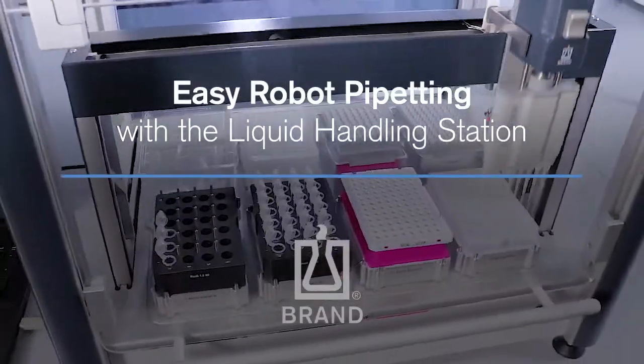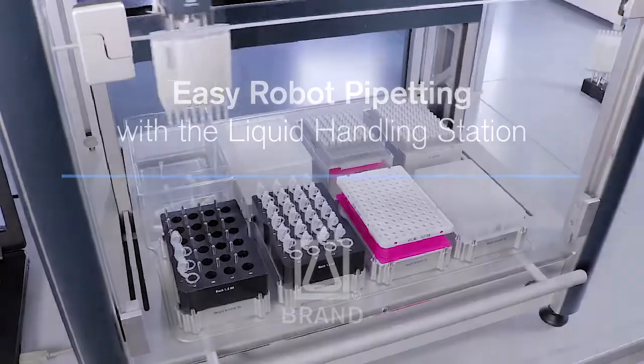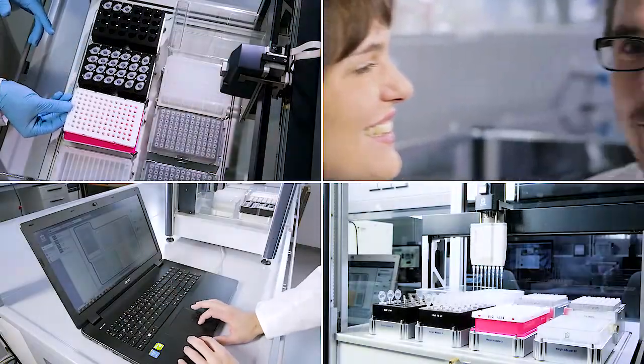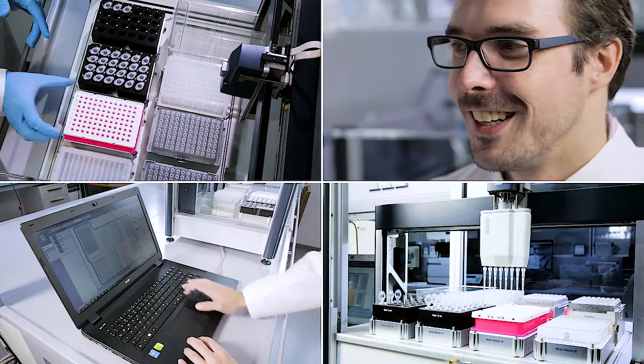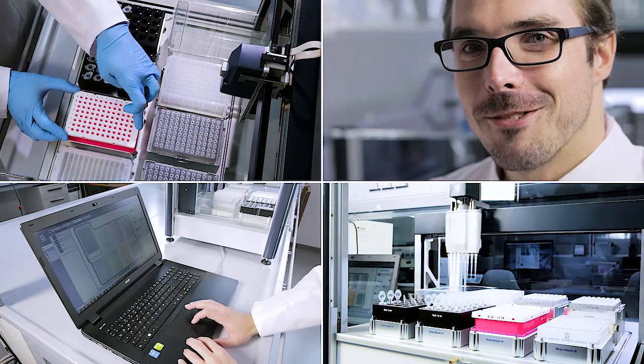How does a pipetting robot work in the lab? Katrin and Thomas tested the liquid handling station from Brandt. Let's see how they use it to set up a PCR.